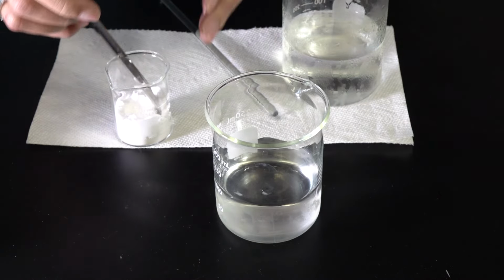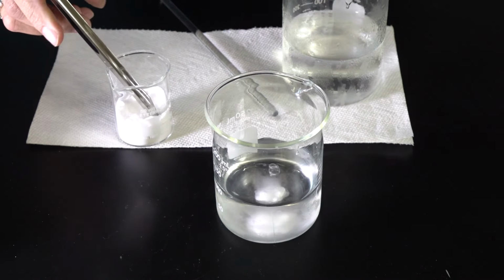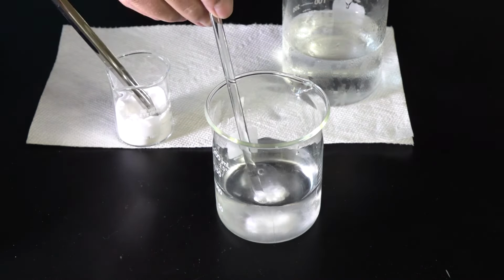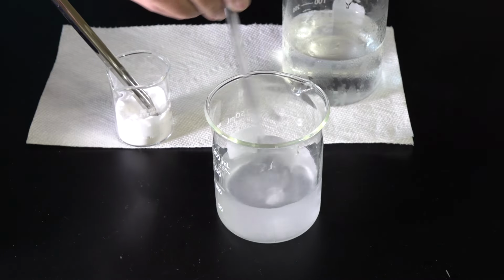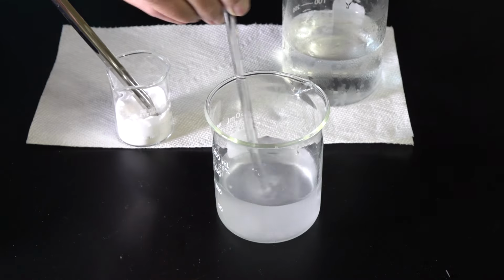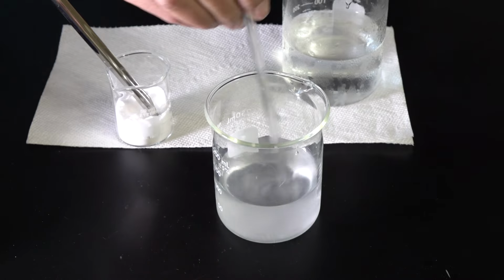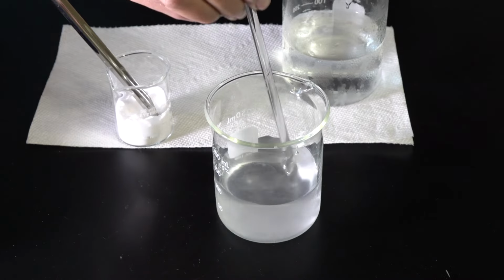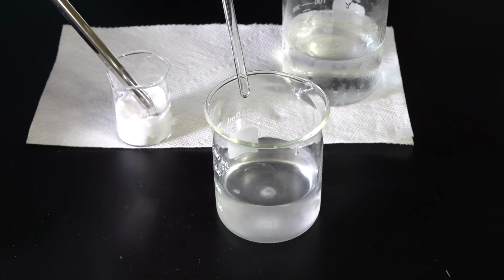Keep adding by scoopfuls and stirring, and you'll need to pause between episodes of stirring to see if all the powder disappears from the bottom of the beaker.